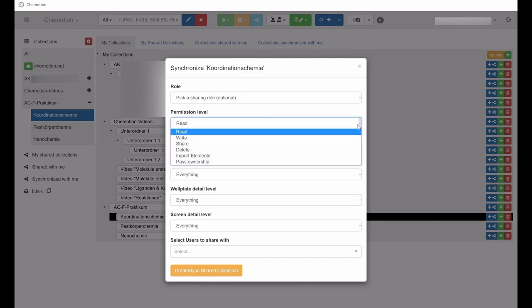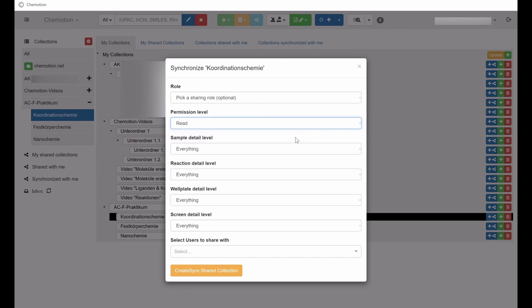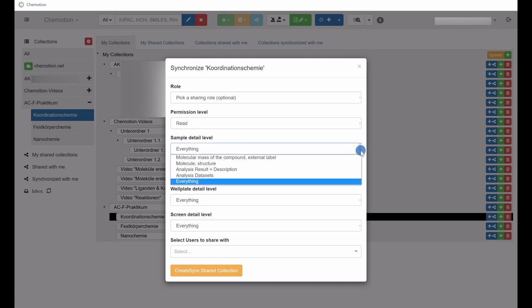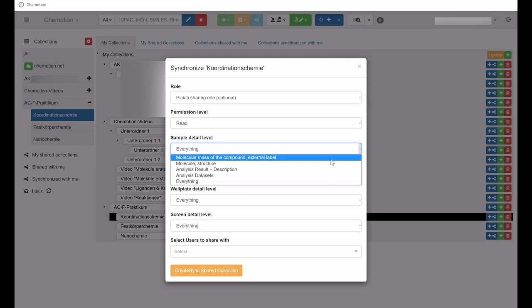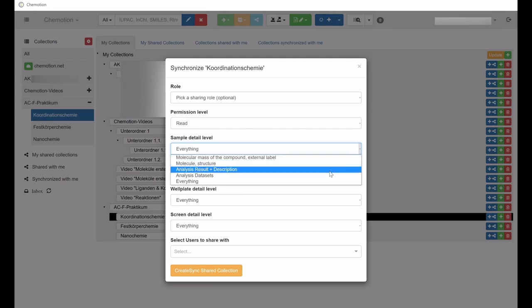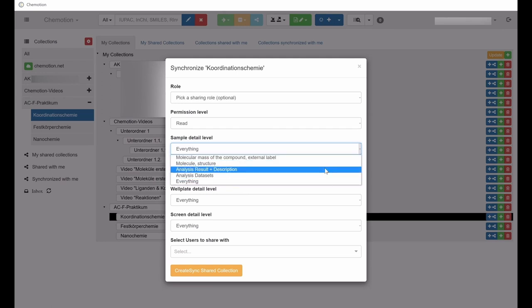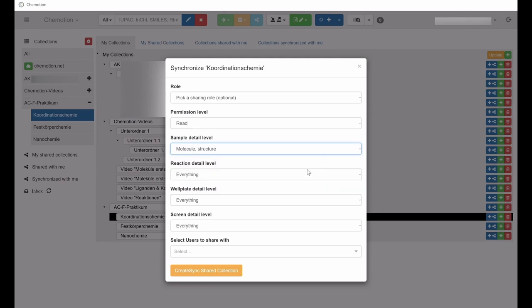For each of the categories, meaning samples, reactions, well plates, and screens, you can also clearly specify which exact elements are made available during the synchronization process.